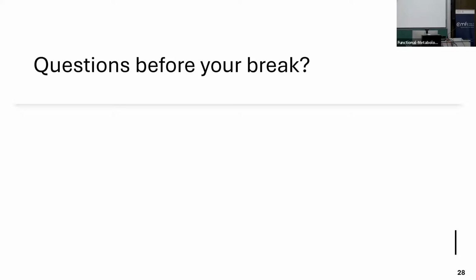They can be highly mutated on the plates also. If you see phenotypic differences, go for the ones that look identical. Yeah, sometimes we have that with actinomycetes, they just mutate on the plate and some colonies look slightly different. So you want to go with the ones that are really phenotypically identical. In that case, the same frozen stock is also very important. Now we are measuring per milligram how much agar we put on the plate so that they're not different. So it's a nightmare, but very interesting.